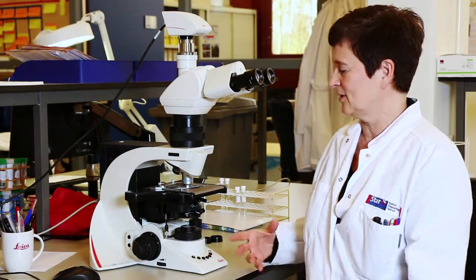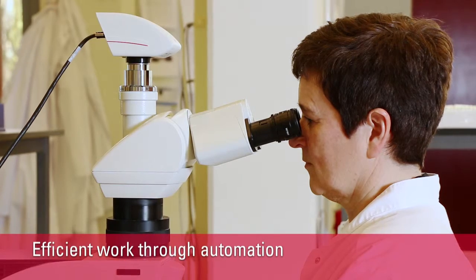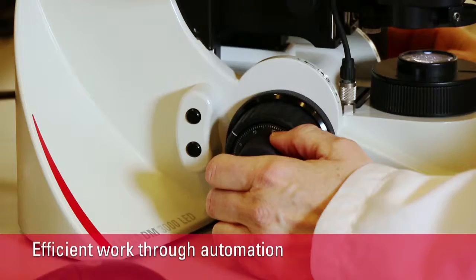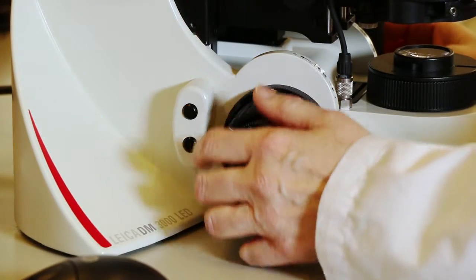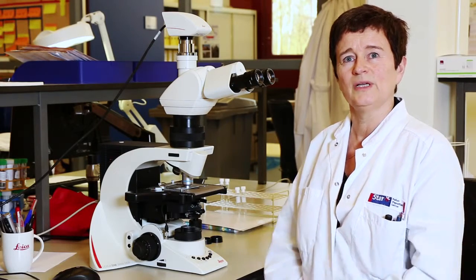The microscope is very efficient when we are busy. You can look through the microscope and with the objectives you don't have to touch them to change them. You can use these buttons so you can keep looking in the microscope and interchange between the two.